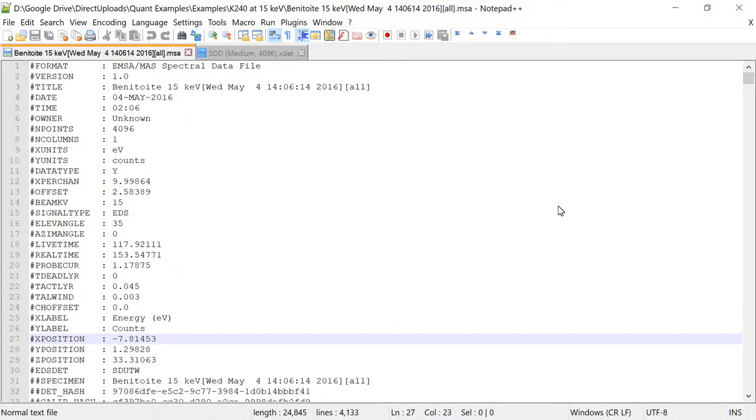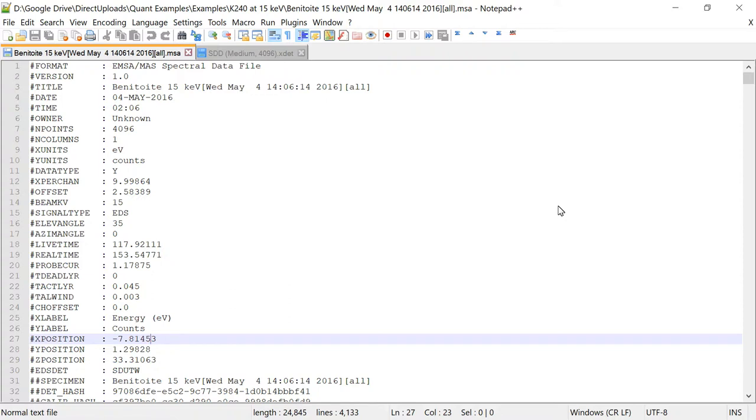Let's take a look inside a typical spectrum file. There are many different formats of spectrum file. Some are binary, so you can't really look at them. Some are text-based, so we can. I'm going to look at the ISO standard EMSA MAS spectral data file format. That's one that's available from all the vendors, so you can always export your spectra in this format.